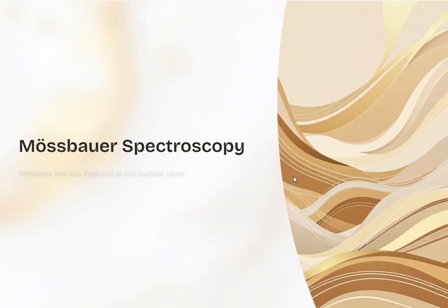So in case of Mossbauer spectroscopy, the source will be producing gamma radiations. As we know, gamma radiations have some significance. They are very high intensity radiations. Also, when gamma rays are emitted, the source will be moving backwards. And when it hits a sample, the sample will also be moving, because this is the specialty of a gamma radiation.